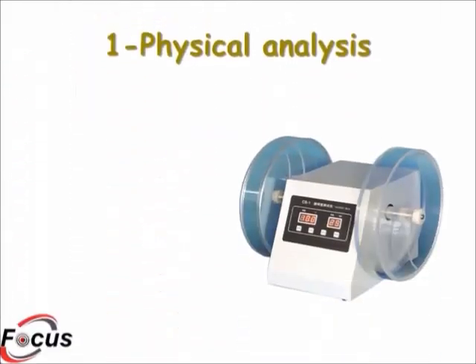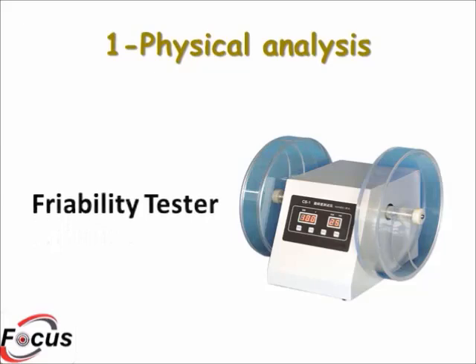As an example of physical analysis by instruments is the friability tester. This test is to ensure the tablets can tolerate blistering, storage and shipping process without breaking and losing their weights.